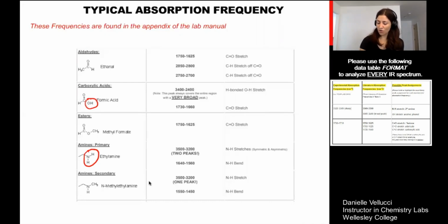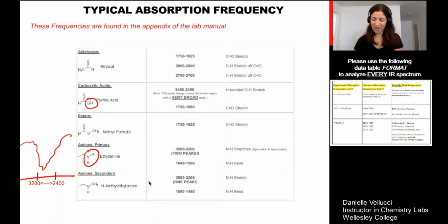So when I have a carboxylic acid in my IR spectrum, in that region around 3200, instead of seeing the nice smooth peak that we saw for the alcohol, it's very common to see the peak be what someone I taught with once called a monster peak. It tends to become less smooth and a lot wider and almost more poorly defined, okay? Wider and messier. Okay.